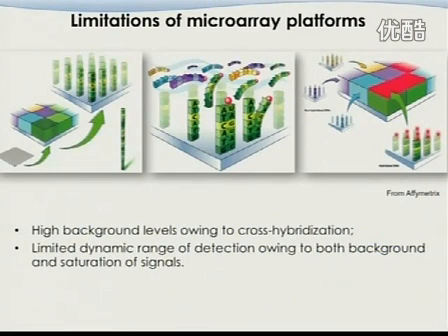The reason is that in the detection step, you count how many red hats are in each compartment. If the gene expression level is really, really high, that compartment will already be saturated. Take GAPDH, for example, a gene that is expressed a lot in most tissues.